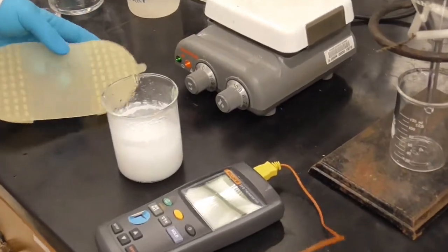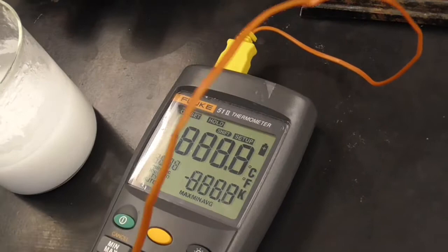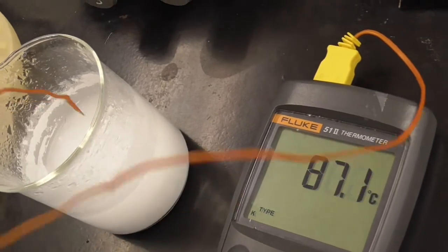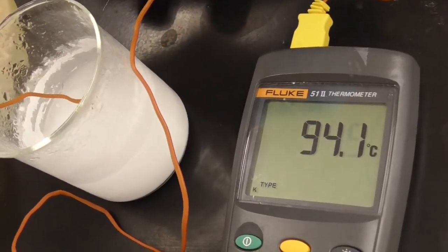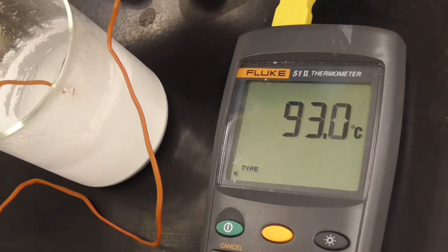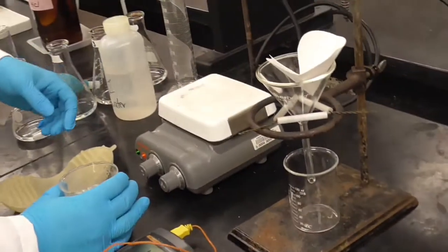Okay. So we're going to measure the temperature here. Come on. Okay. Sorry, got the cord in the way there. Okay, that's about the temperature. All right, so now we're going to hot filter this.